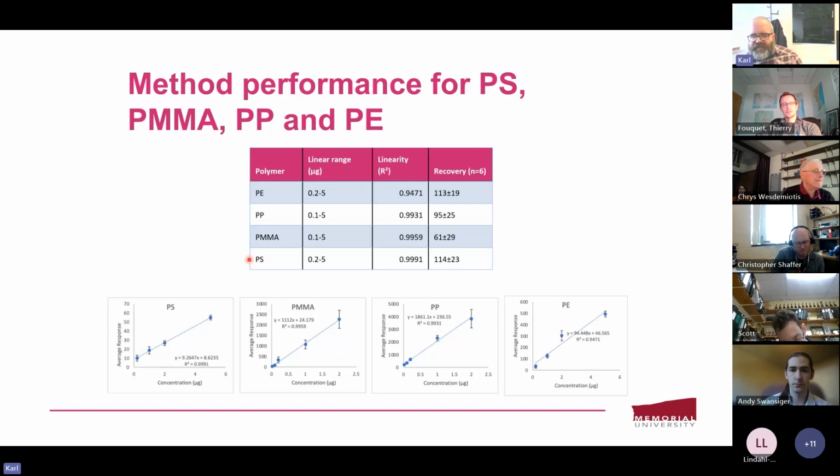So what I take away from this first shot at things is, yes, it's a difficult experiment, but even if polystyrene's response factor is low, we're generating rather conservative numbers if we're trying to assess exposure. Low response equals high concentration, and those concentrations we're observing are still lower than we would expect to cause an observable effect. So I'm convinced that, as we gain more experience with the instrument and with the method, we'll get better quality numbers.